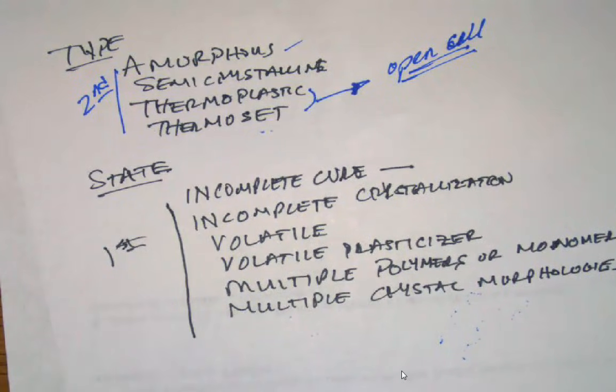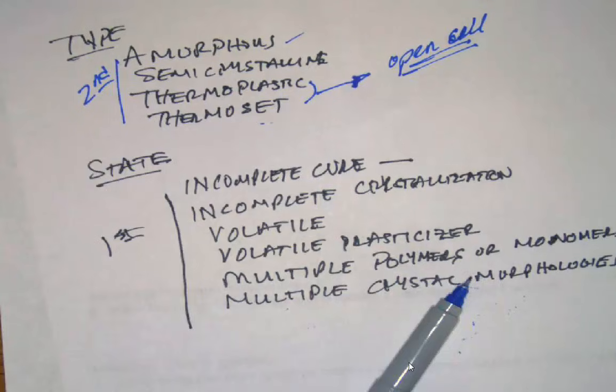That's all you're going to be looking at. All right, so I think that's most of what we need for DSCs, and hope this helps.